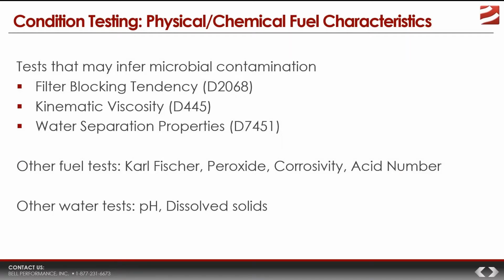Now, we can also do other physical tests to assess the physical state of the fuel. And those don't just assess it in a vacuum, but can also help judge whether these tests can infer microbial contamination too. I mean, that would be helpful, right? What tests can help infer the presence or not of microbial contamination?